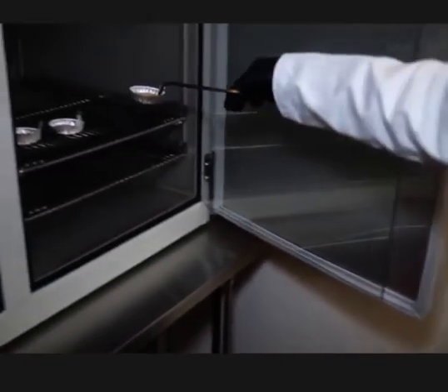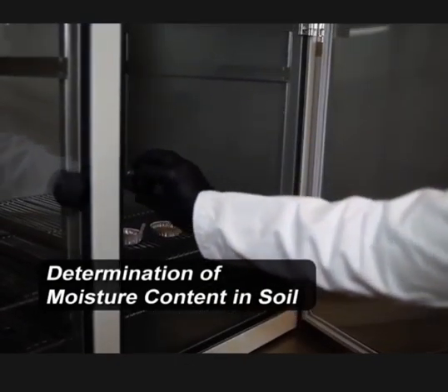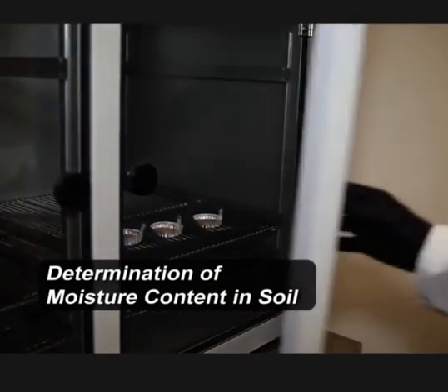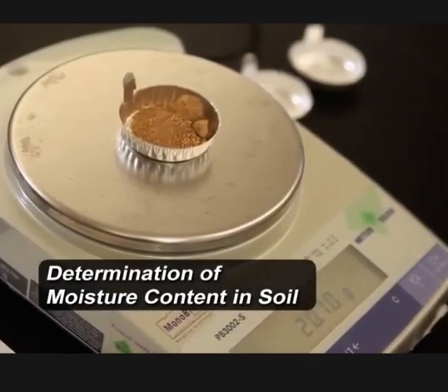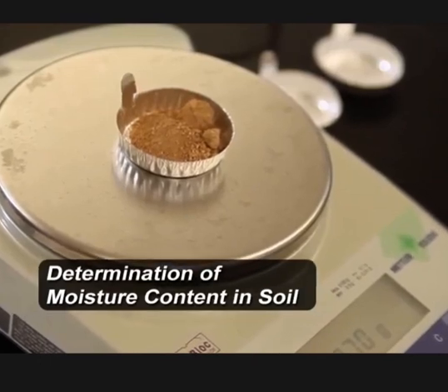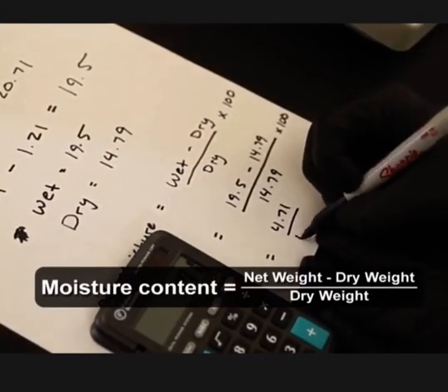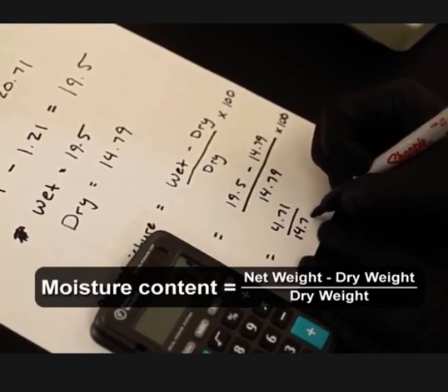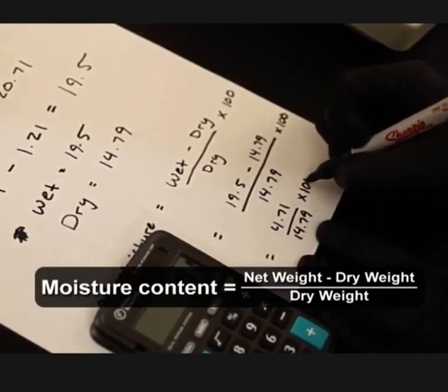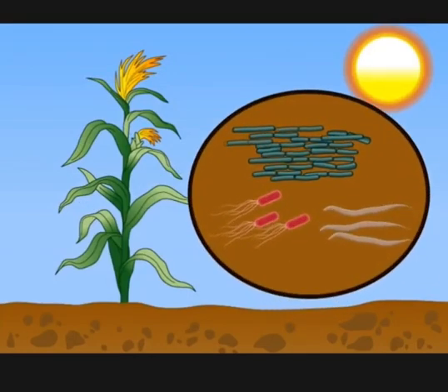Calculate the water content in the soil using the technique shown in this collection's Determination of Moisture Content in Soil video. Based on this calculation, determine the amount of water in the soil on a dry weight basis. Now calculate the amount of water that needs to be added to give a 15% soil moisture content. This brings the moisture to field capacity, optimal for microorganism growth.